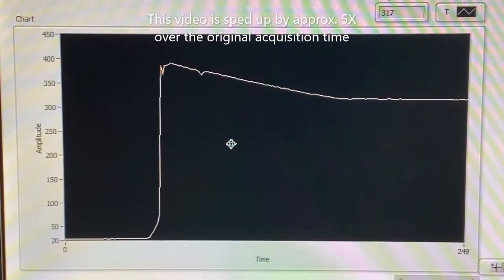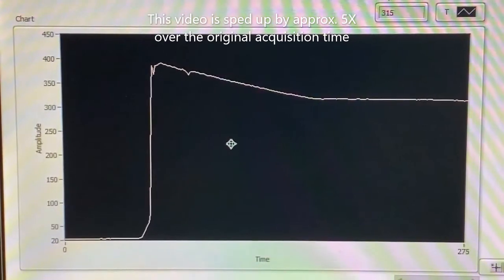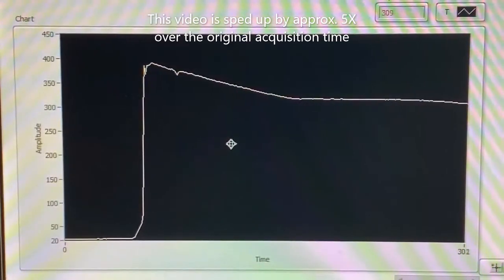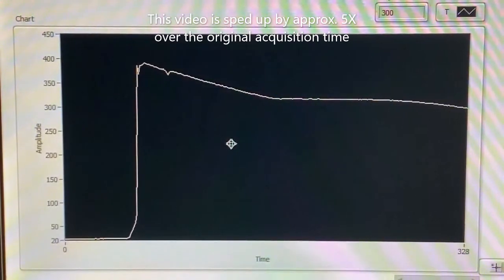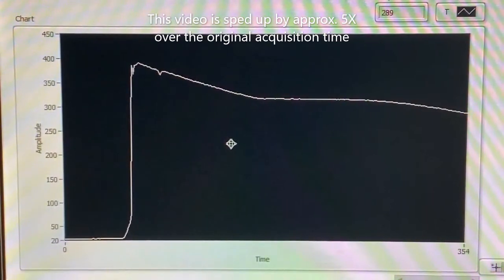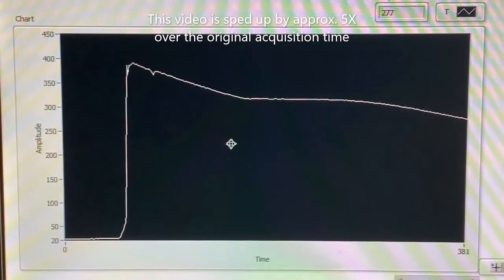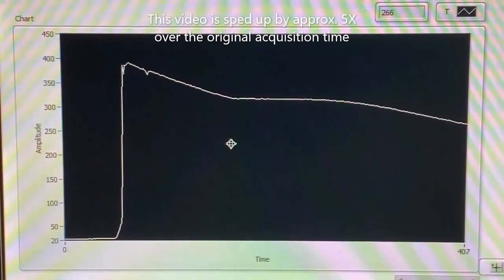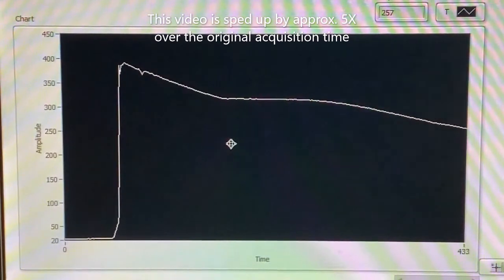At that temperature, the liquid must transform to solid, giving up the heat of fusion. But the liberation of the heat of fusion is not instantaneous, but rather requires time. The heat of fusion must be liberated as a function of time, and so a horizontal isotherm occurs until all the heat of fusion is given up and all the liquid is now solid, at which point at 318 degrees C. This measurement is defined as the melting temperature, slightly off the actual temperature due to the calibration of the thermocouple.